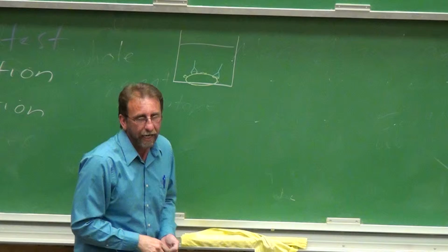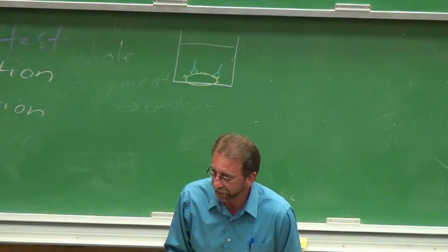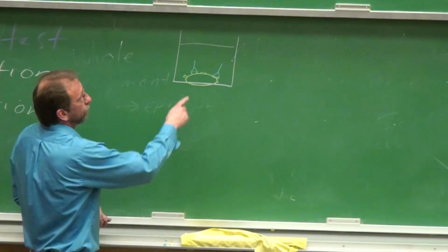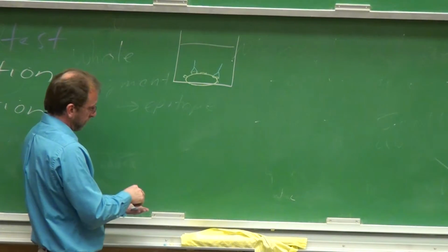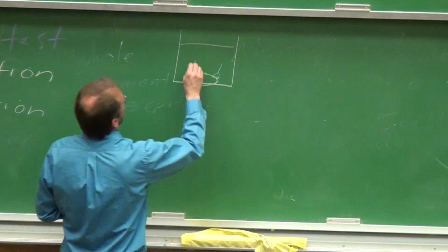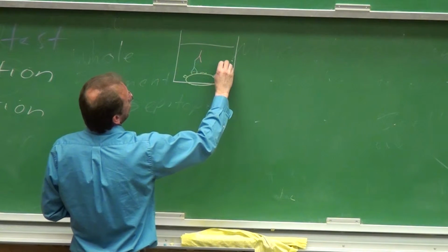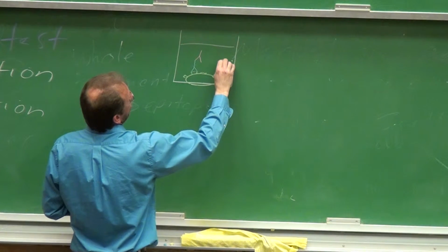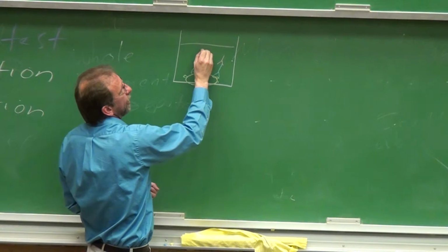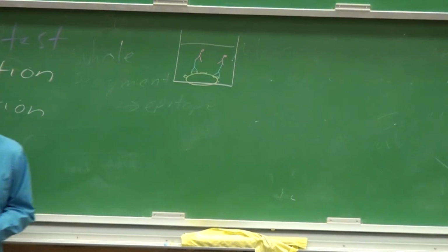Wash this away, and then we expose the wells again to a different antibody. An antibody created by an animal like a mouse that responds to this antibody. And so it will bind to it like so. But we've also attached an enzyme to this second antibody.